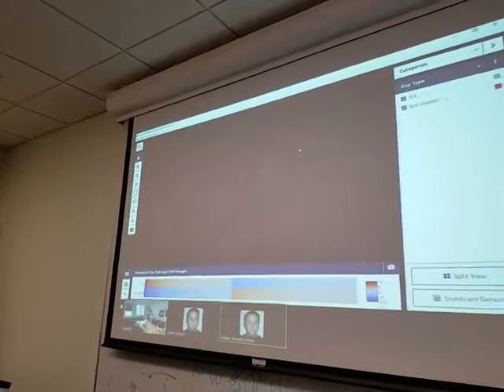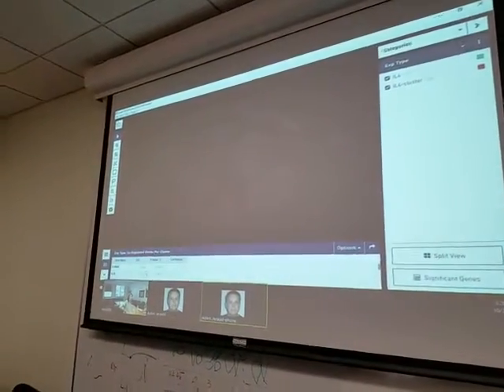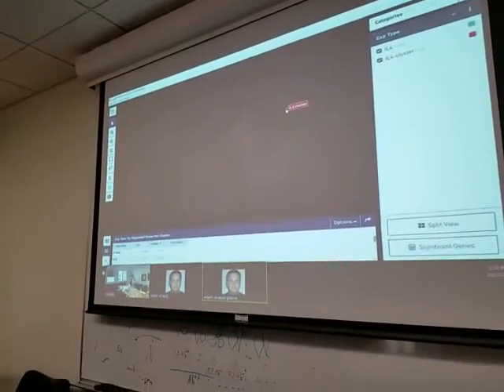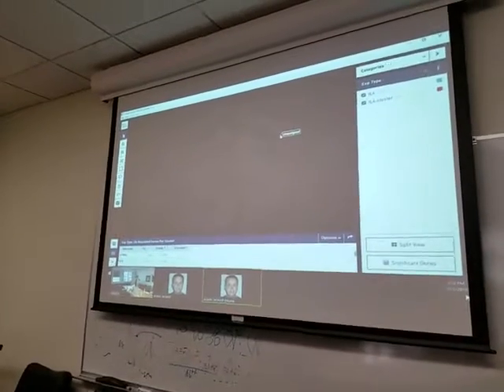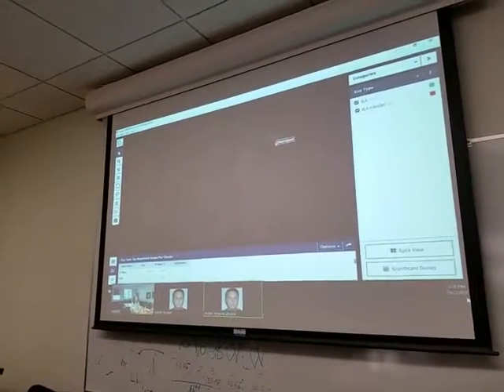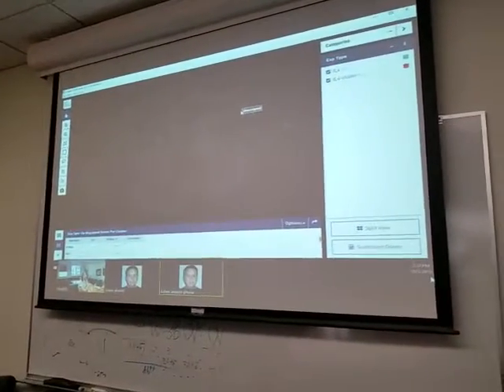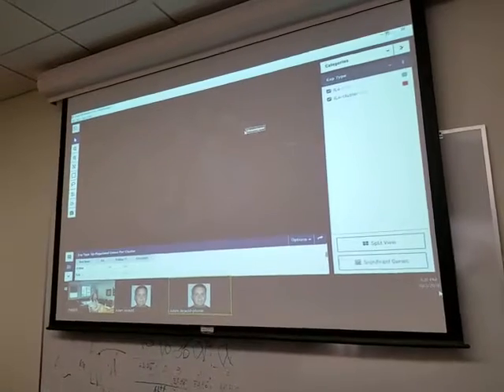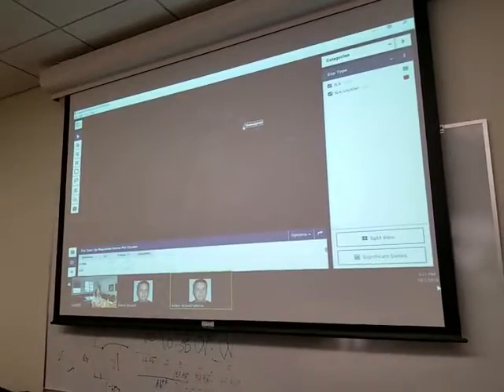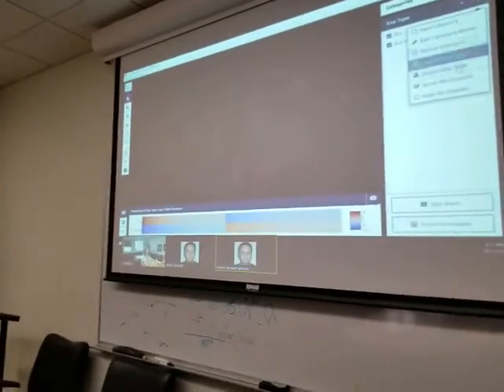Yeah, but again, right now, this heat map here, or the tabular view, is just looking at what is top differentially expressed between the red and the green here. Well, it's something. Within any given red one, there are hundreds of other genes being expressed as well. Right, but you could export that. The high and the low, what you just did, the barcode. Yeah, those you could export.